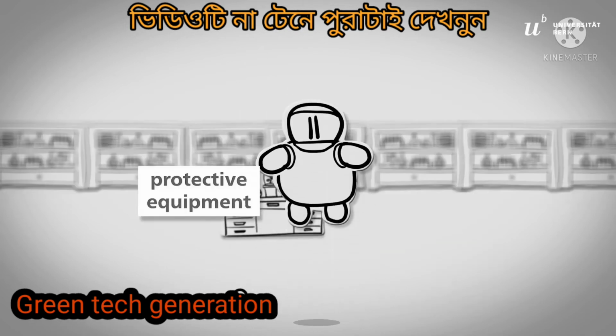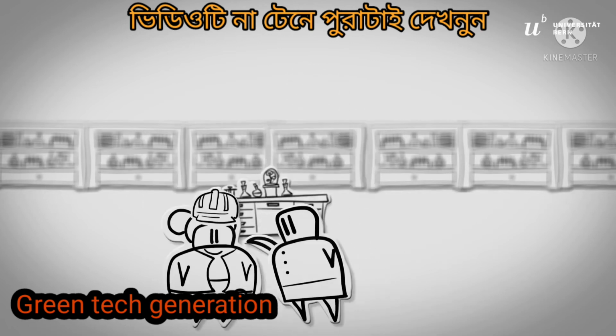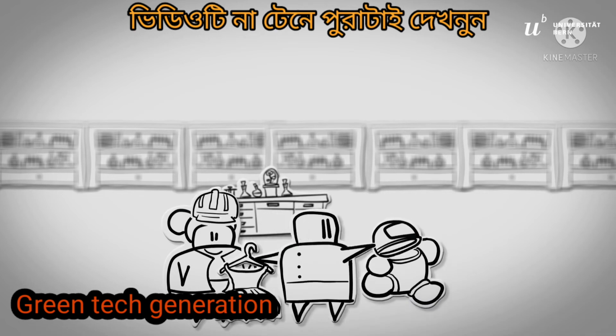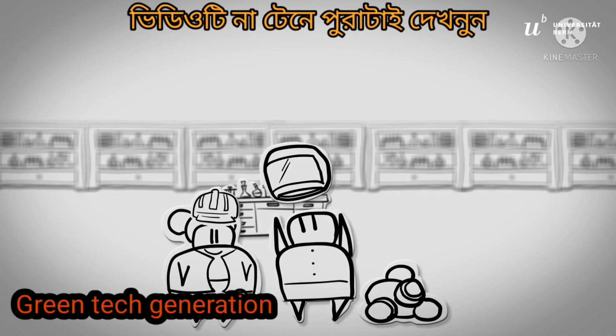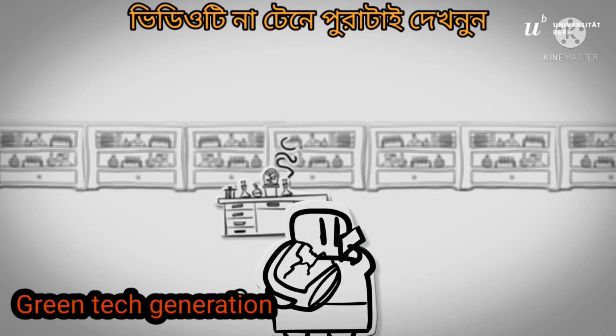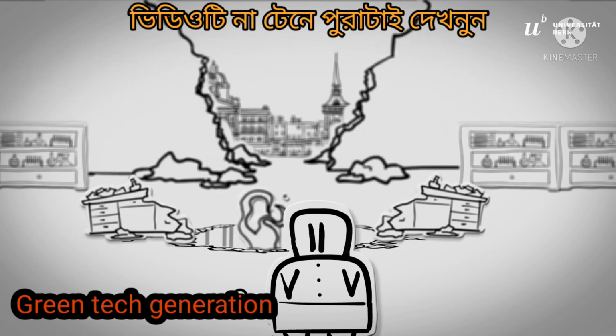Use personal protective equipment as required by your activities with chemicals. Contact your supervisor for instructions about what equipment you need and how to properly wear it. If you notice damaged material or infrastructure, or if there is an incident, report it to your supervisor and chemical safety officer.